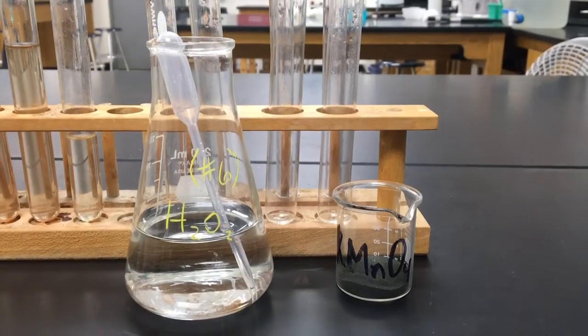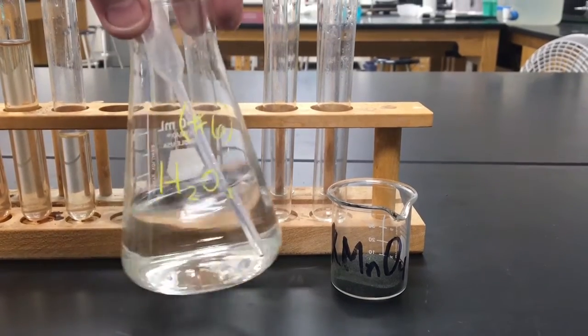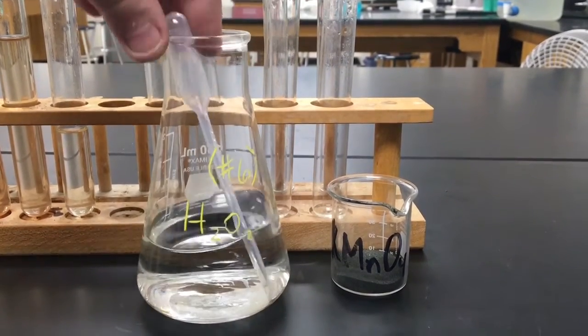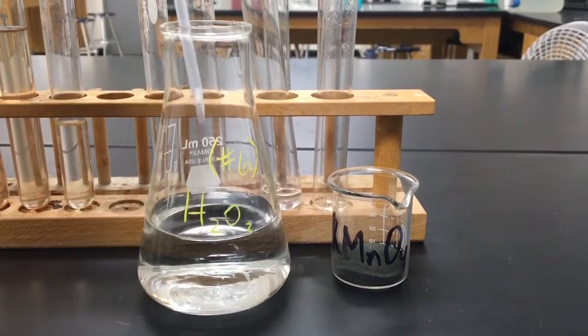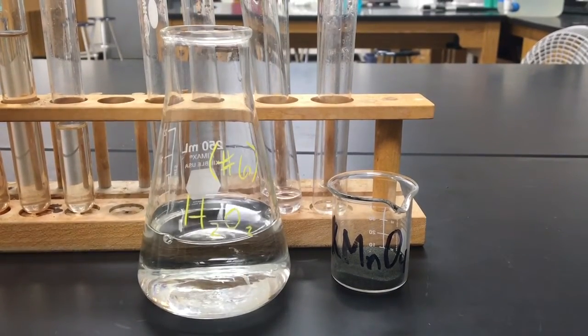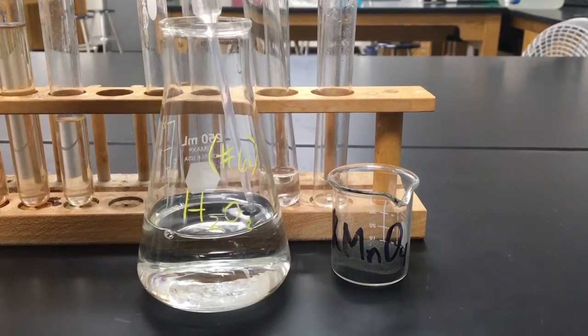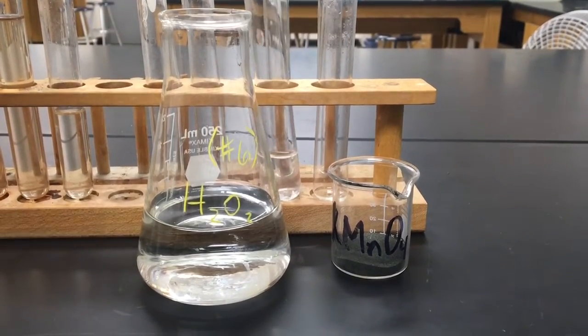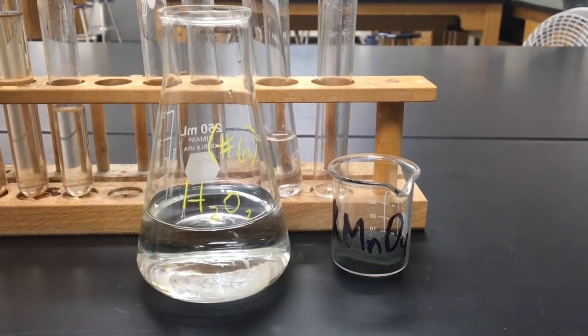Right, here at station number 6, we are going to be adding a little bit of hydrogen peroxide to our test tube, and then adding a very small scoop of this KMnO4 stuff that I've got here. So go ahead and write your observations of each of them. I'll get you a little bit closer look at that KMnO4.